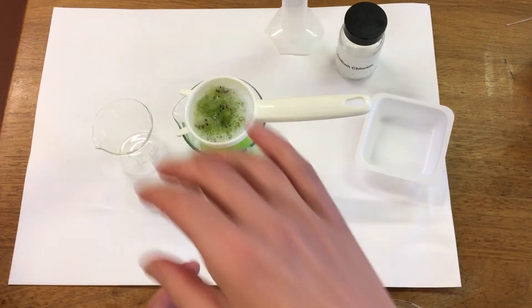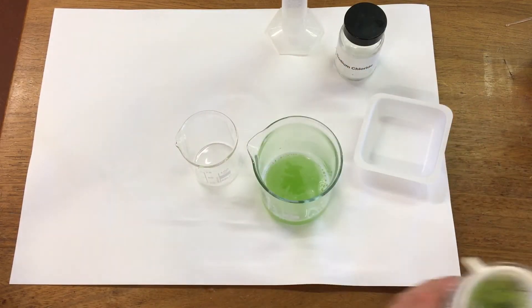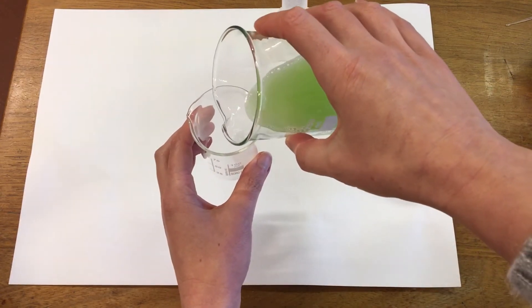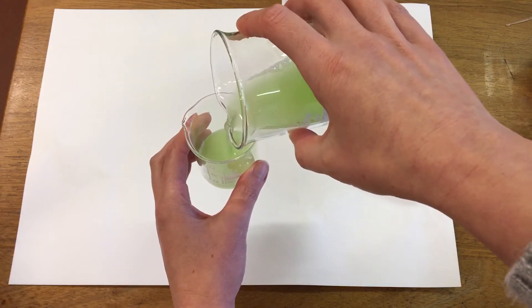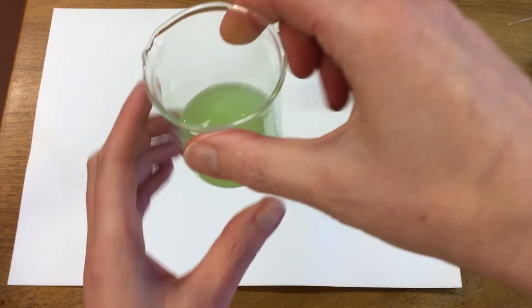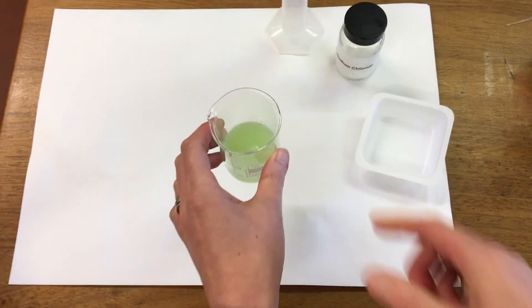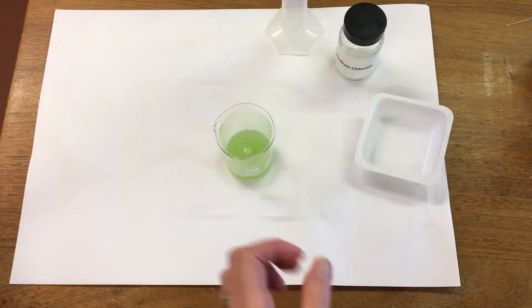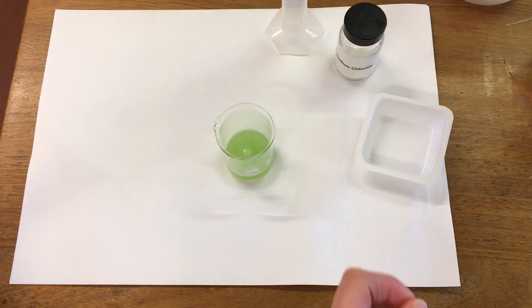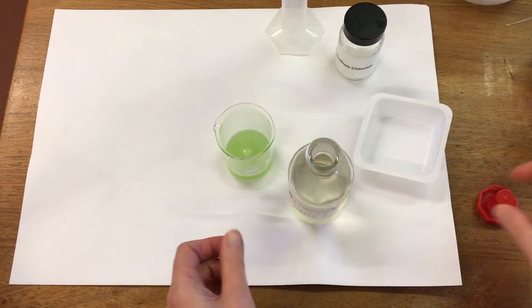I'm then going to pour about 10 mils of our solution into a fresh beaker. You can see we've got our kiwi solution there. The next thing I want to add is some very very cold alcohol — this has just come out of the freezer — and we're going to add this to the top of our kiwi solution.